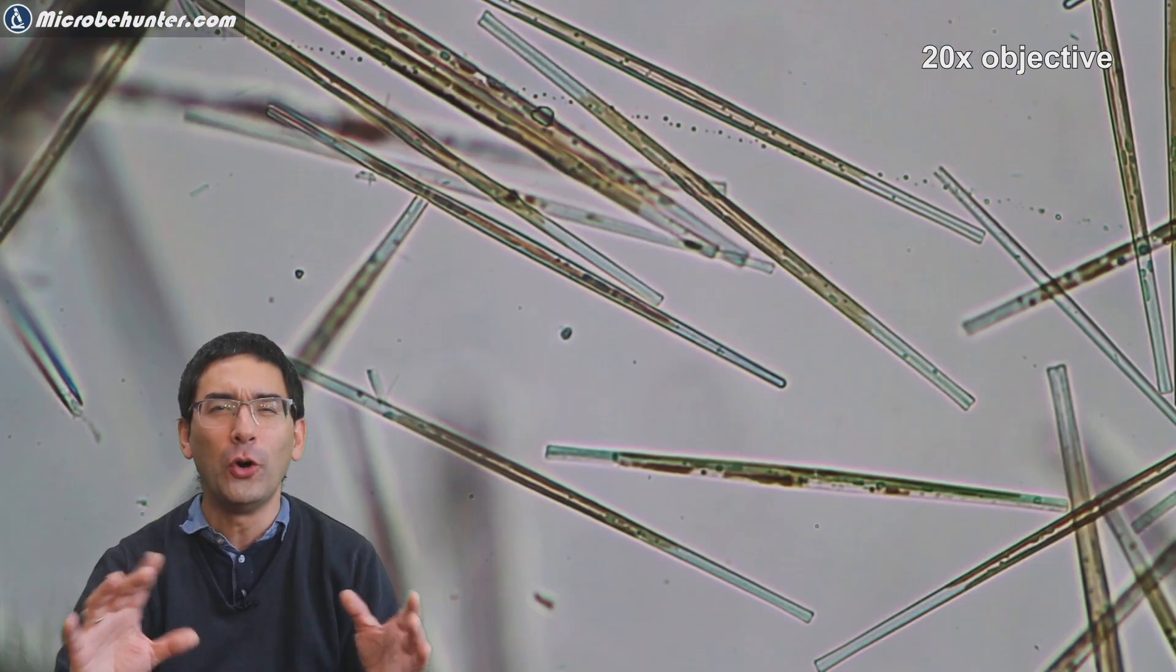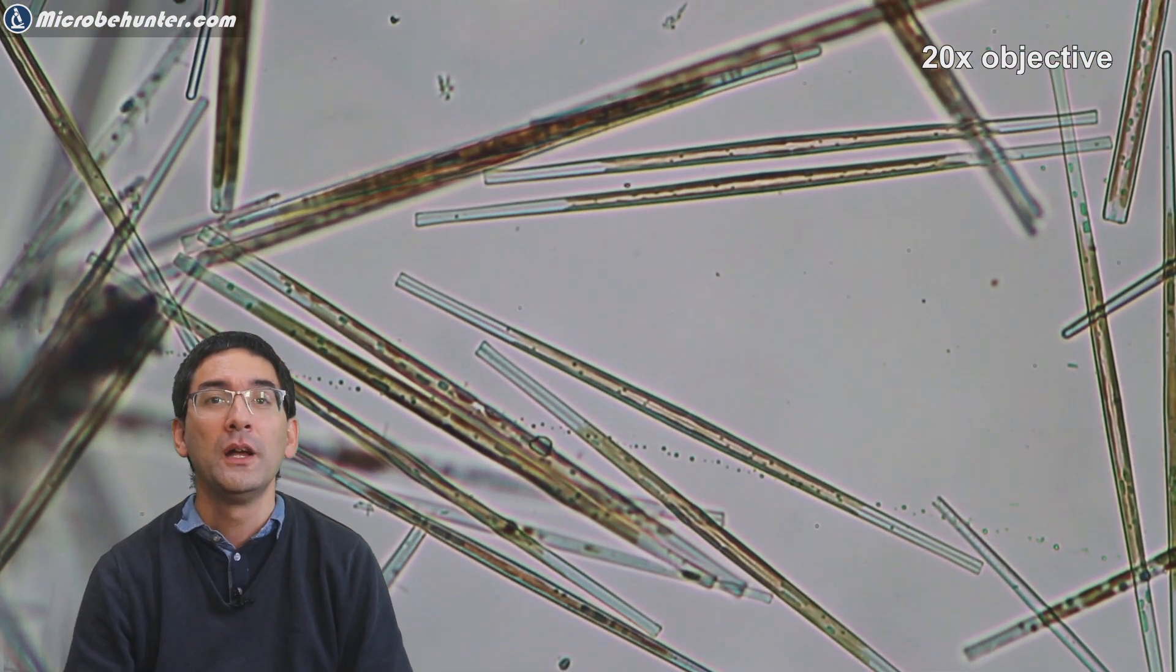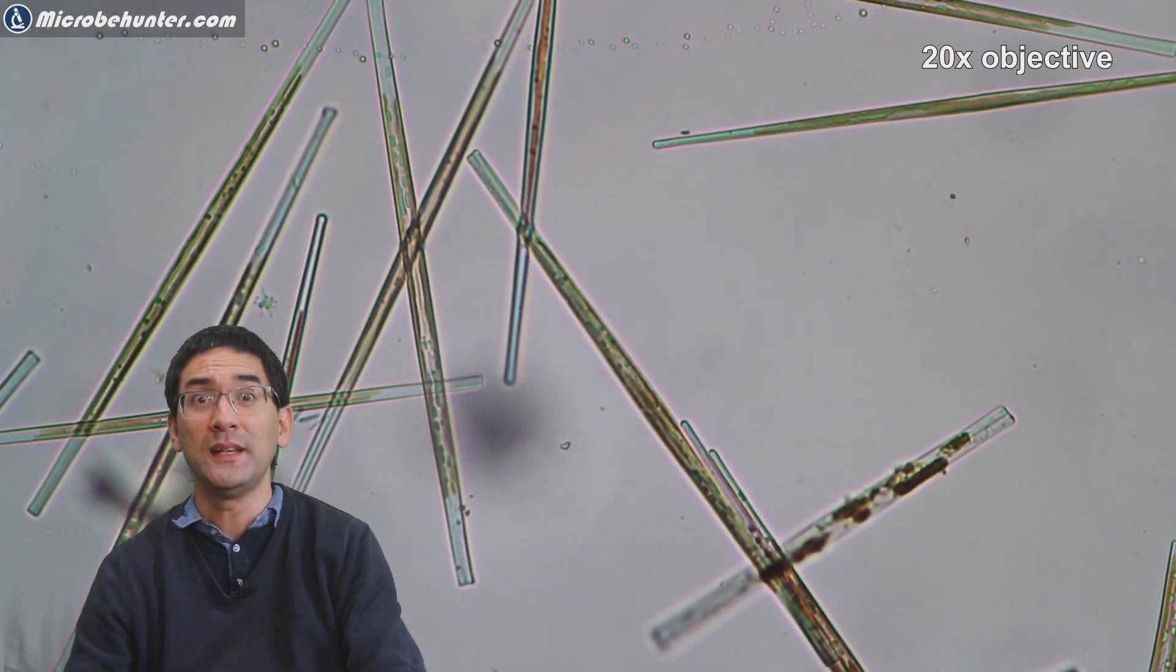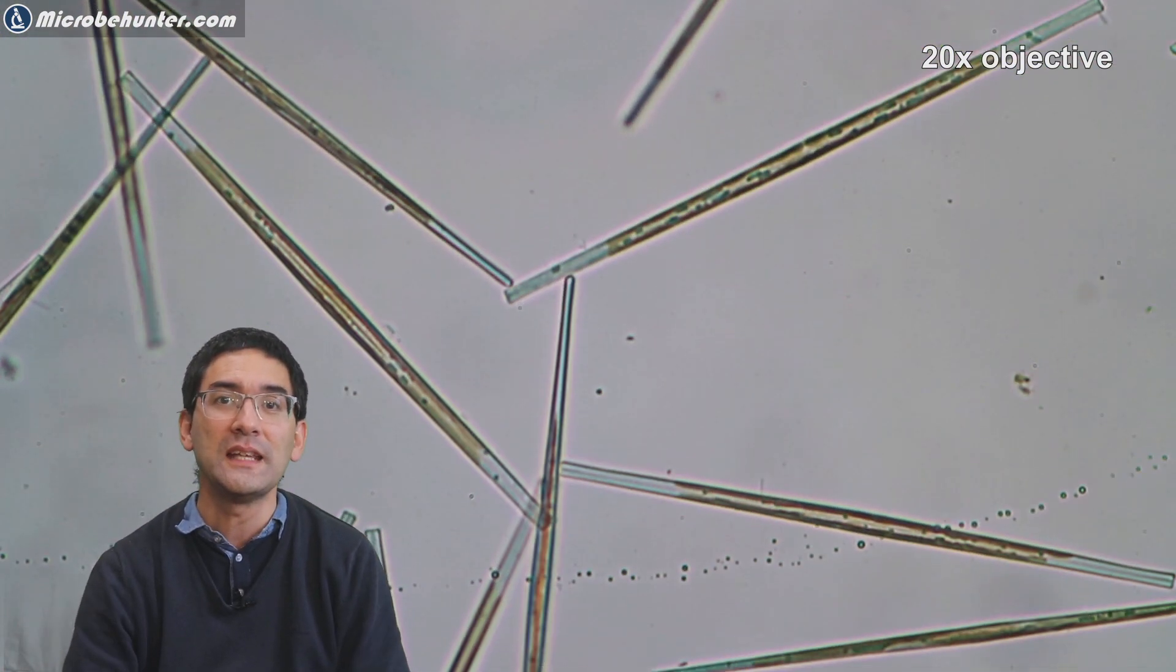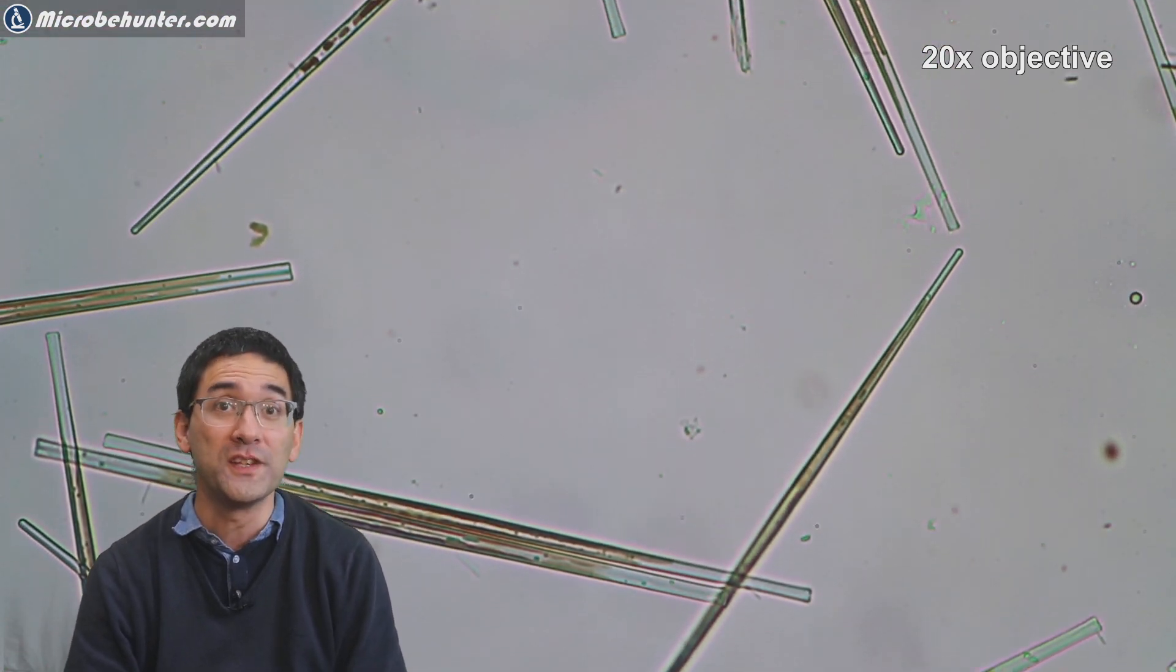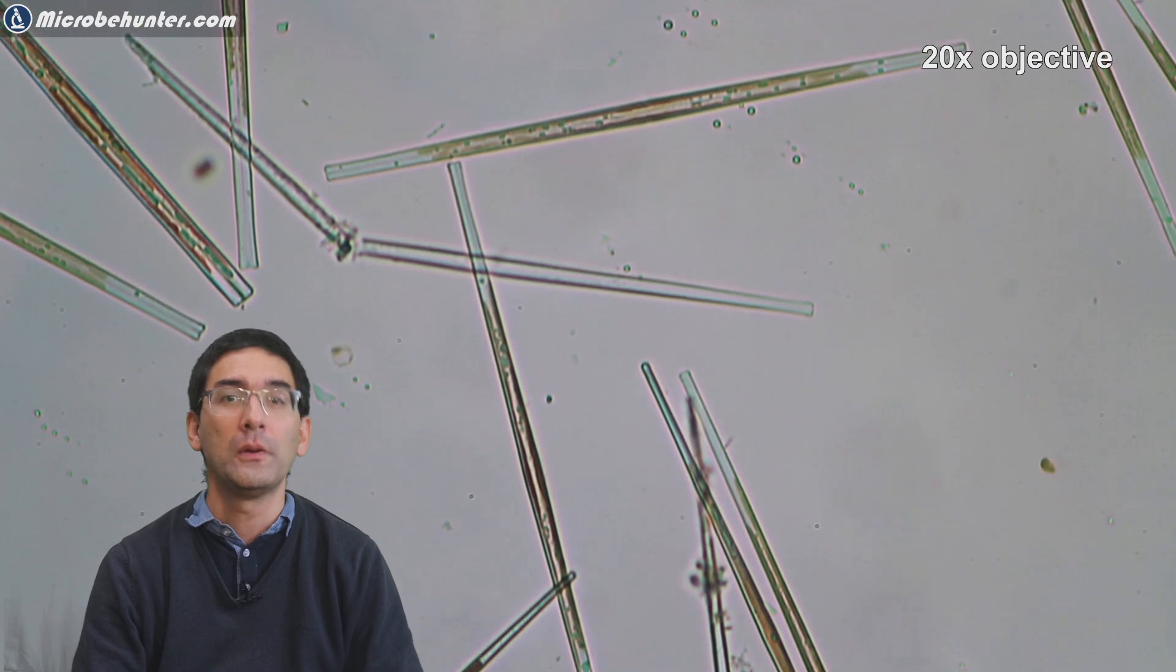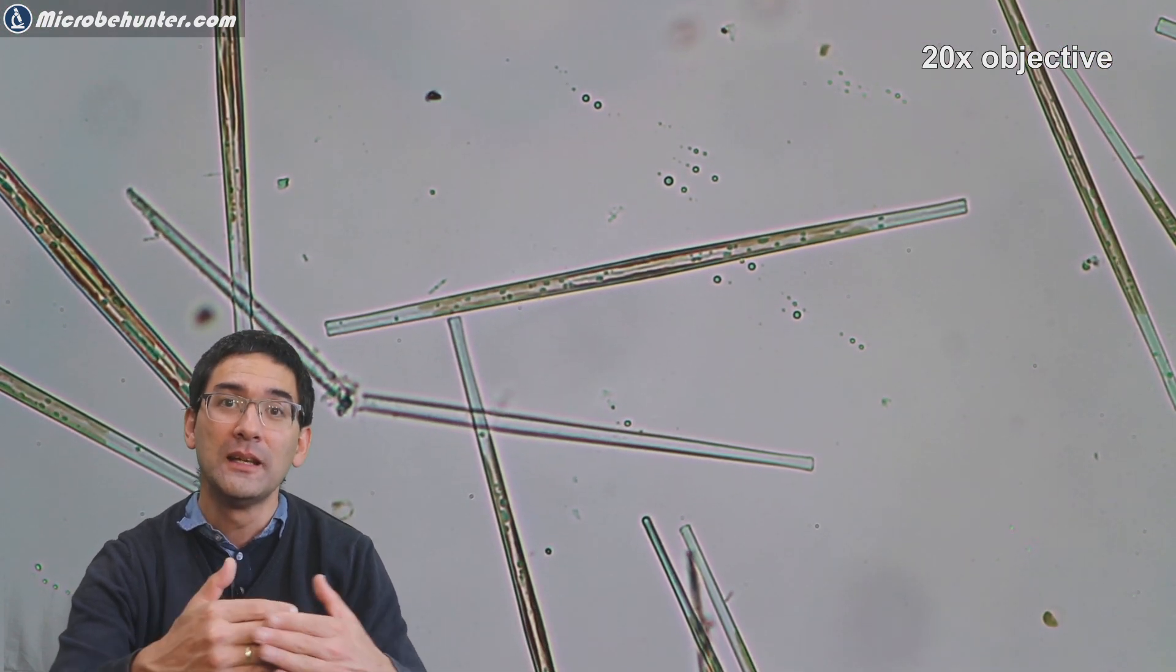I have also seen the odd little ciliates swimming around, but really there were not so many of them, not surprisingly because usually when the water is moving, this kind of washes away all of those free-floating ciliates. Most microorganisms that you can find are actually attached to surfaces, and those diatoms were also happily growing there, partially attached to the other algae and to the side of the fountain.